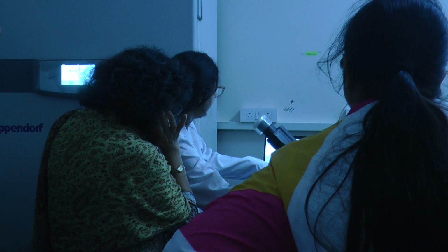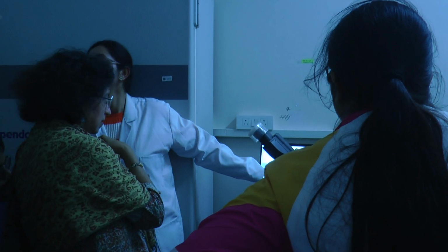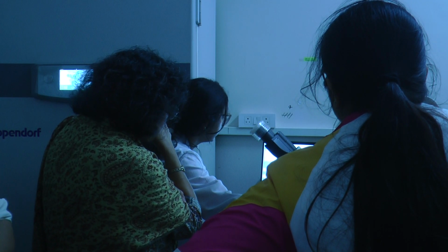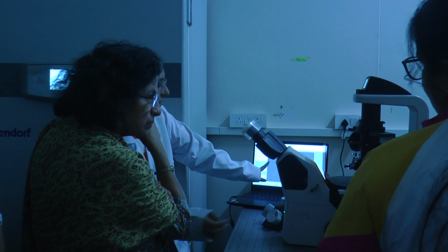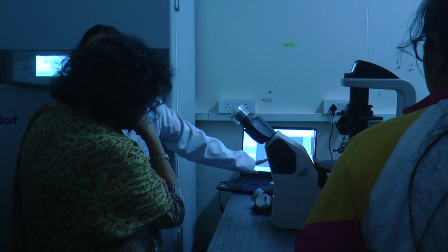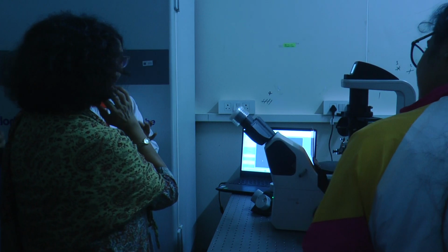Some of the ones who were asking about attachment, we get these structures also. They get attached to each other. And different types of contrast, these are dark contrast, and some are a little less contrast, like the GUVs, they are visible like GUVs also. So dark contrast is, I think, usually because of the cytoplasm.